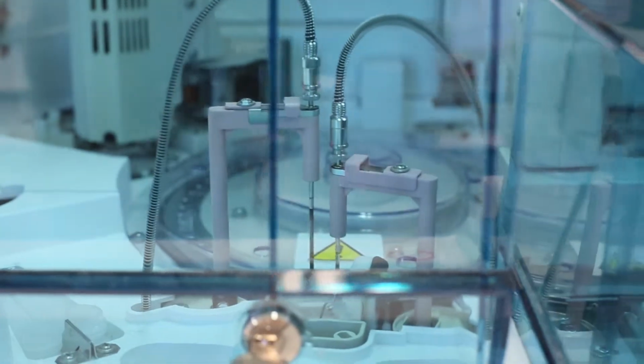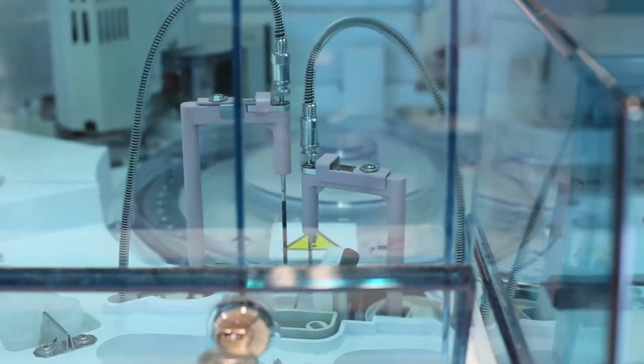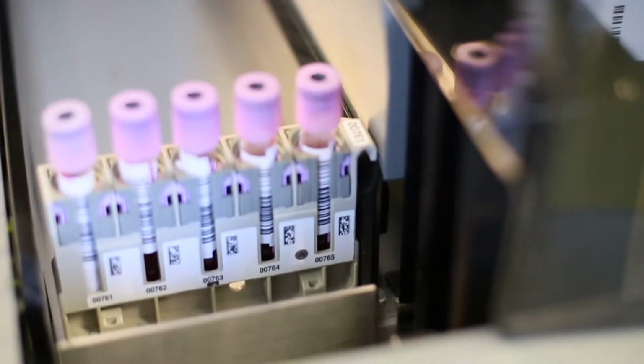As you've been through the department, you've seen that for blood sciences especially, we have very large platforms of analysers, and it's not really easy to have an analyser next to a PC or to have PCs around the analysers that we actually have. So the reason that we went for the iPad is because when we're doing things like maintenance or doing specific duties by these big platforms, they can actually have the iPad with them.